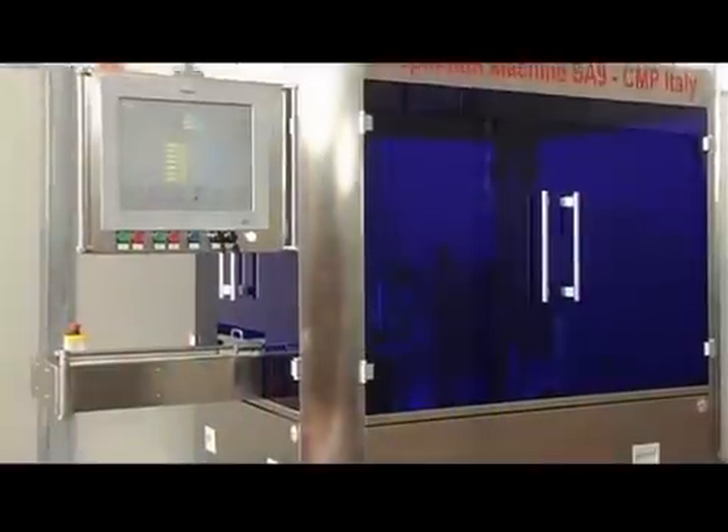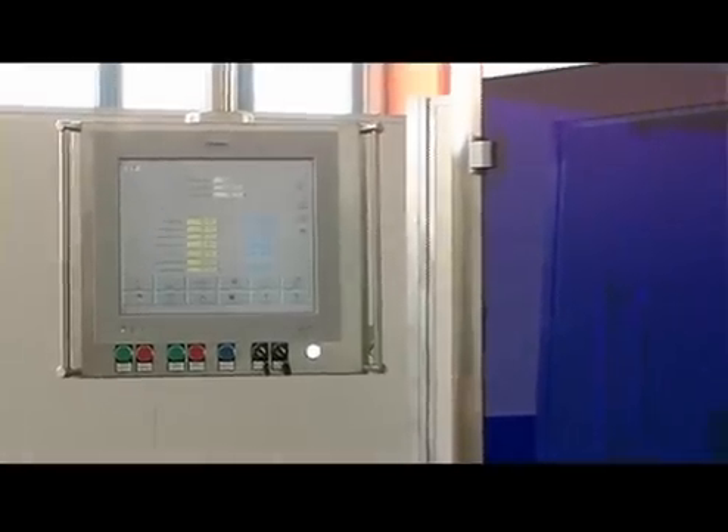Thanks to the features of mechanical robustness and simplicity of use, combined with advanced electronic technology, CMP is capable of offering secure, complete and efficient systems for the inspection of injection products for the pharmaceutical industry.